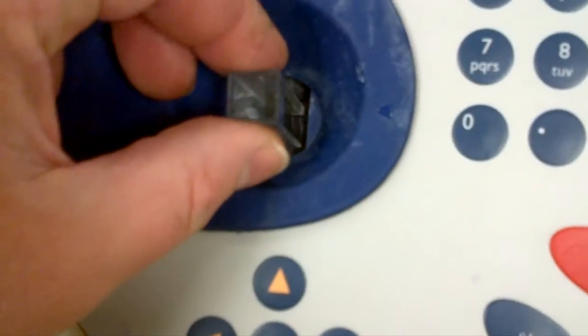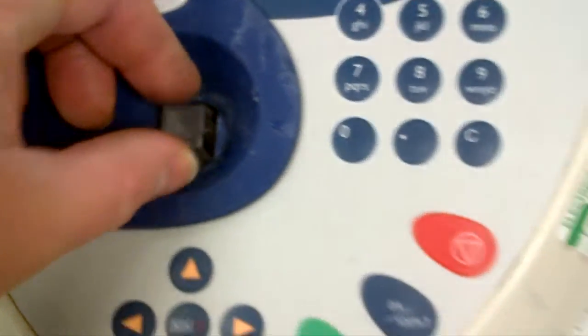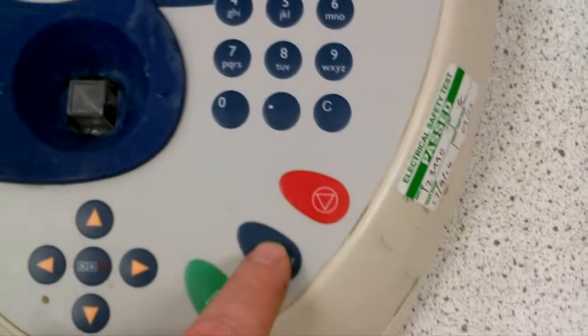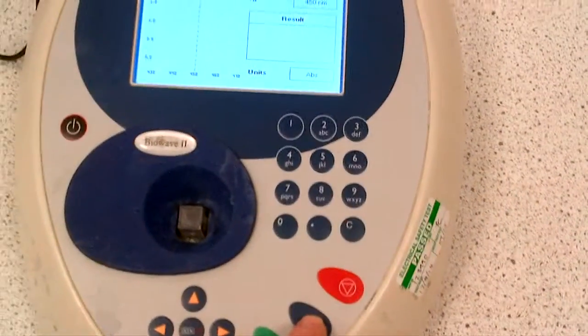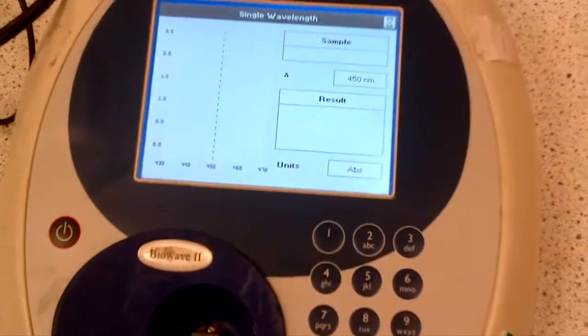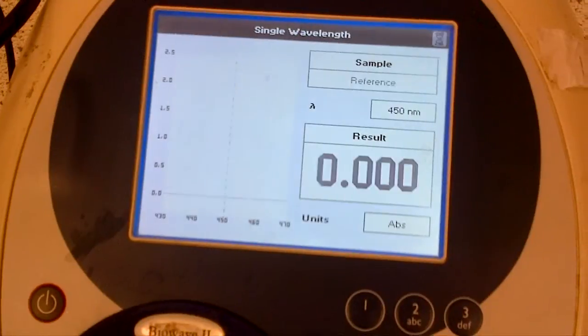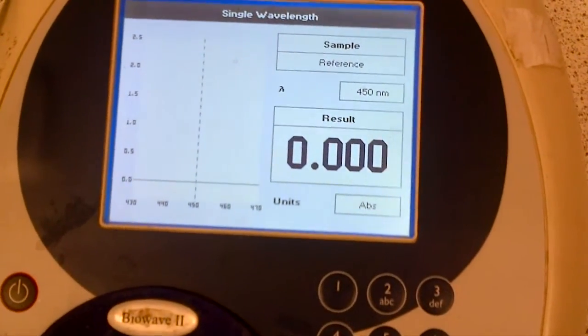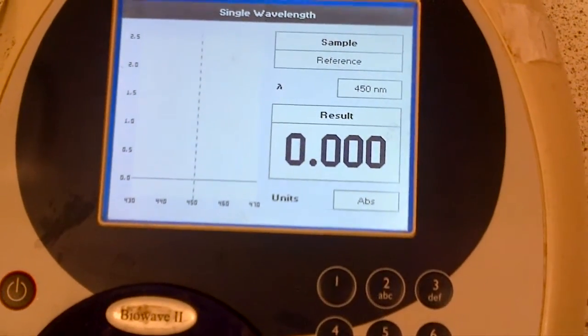So making sure this is clean, put it in, push firmly down, and you need to press blue on the device. Here, for the blank, you'll see the clock appear and hear the sound for it to set towards zero.